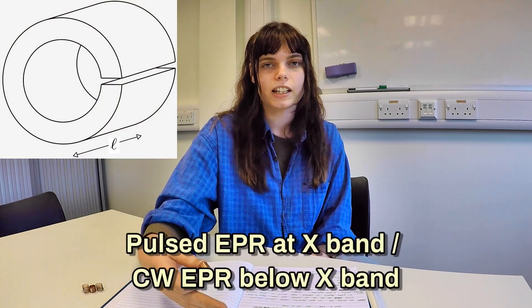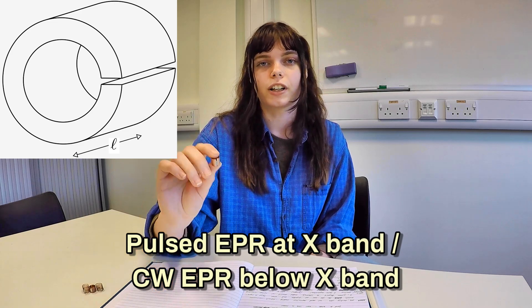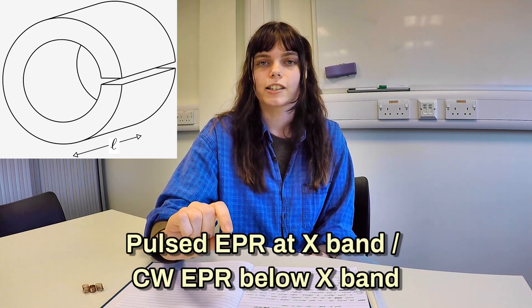So instead what we use is a modification on the loop gap resonator. Loop gap resonators are used for X band EPR and consist of a loop of copper which acts as an inductor and a gap of air which acts as a capacitor. How we've modified this is that we've added extra capacitors across the gap which increases the capacitance and therefore reduces the frequency.